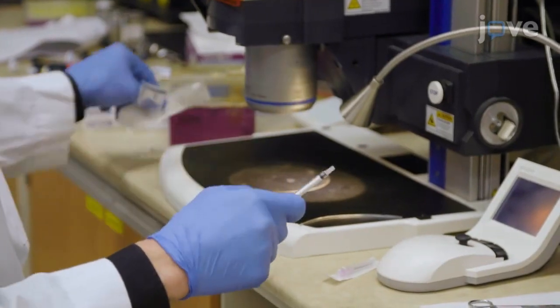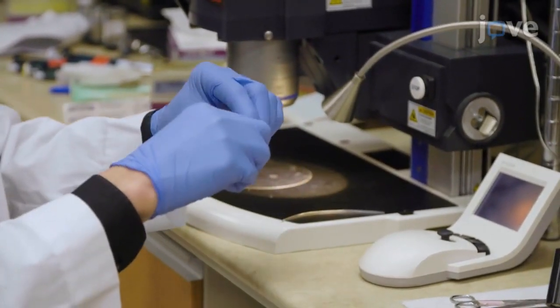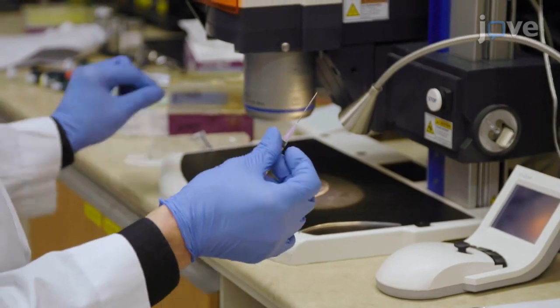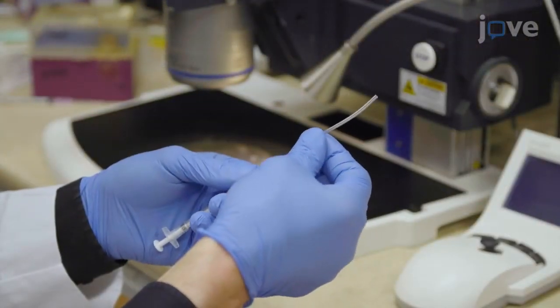To assemble the injection apparatus, mount a needle onto the syringe, and then extend the syringe needle with a 3-5 cm long piece of tubing.